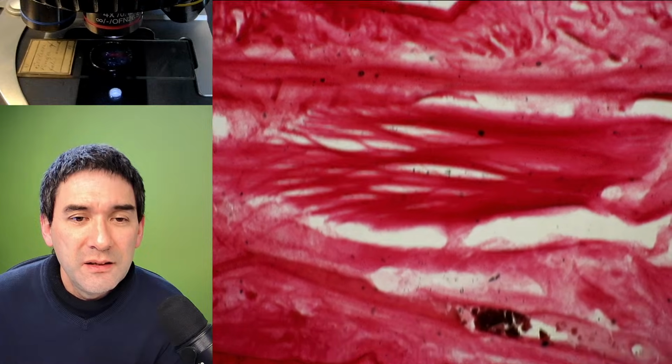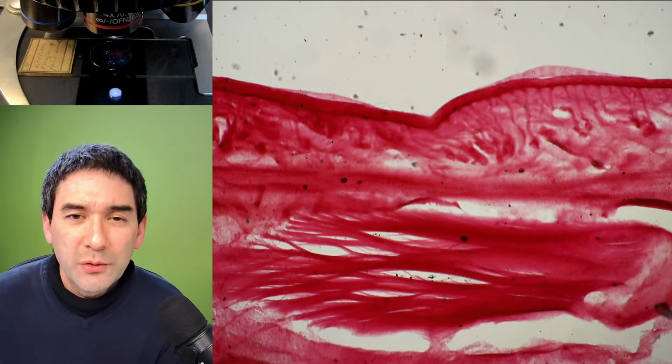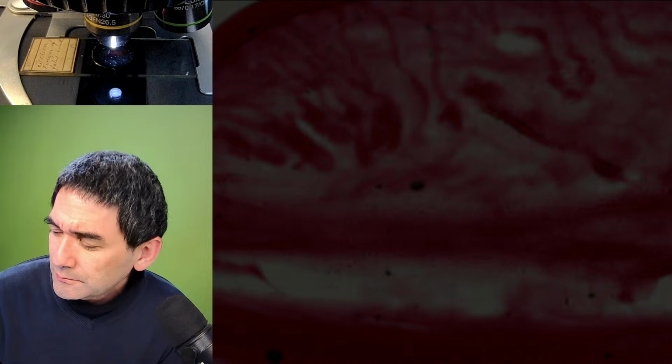So that's basically not quite as interesting maybe. However, you are able to see over here as well.